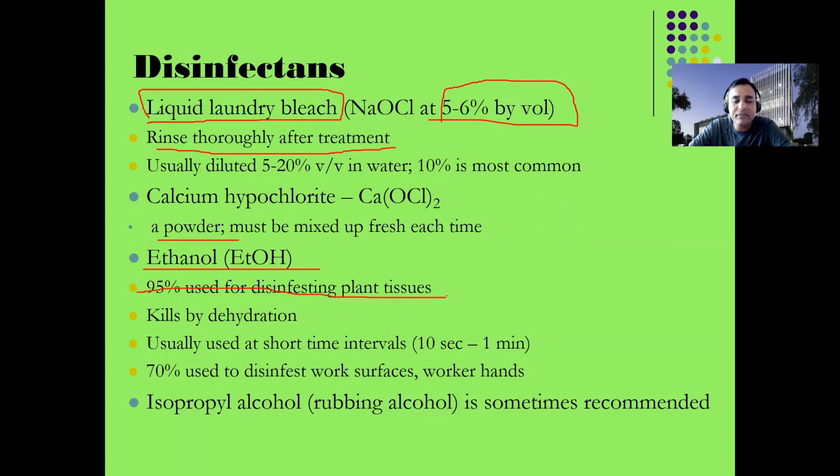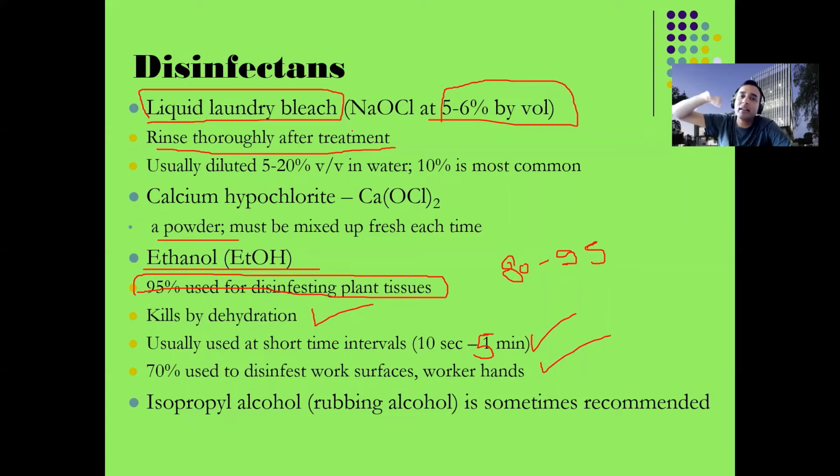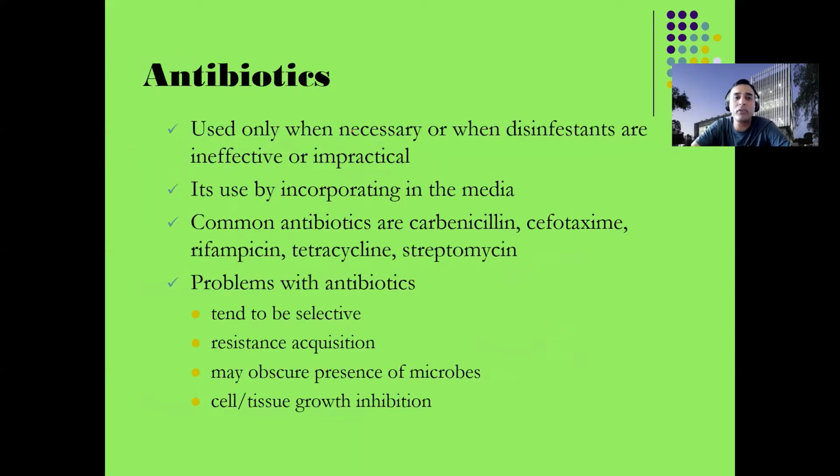Ninety-five percent ethanol is used for disinfecting plant tissues. You can use from 80 to 95%. This kills bacteria by many means: it degrades proteins, degrades the cell membrane, and also causes dehydration in the bacteria. The treatment can be given for 10 seconds to 5 minutes, and then you clean it again with distilled water. So when you have these three treatments, detergent, bleach, and alcohol, with rinsing in water throughout the process, then your explant is ready. That is the normal process.